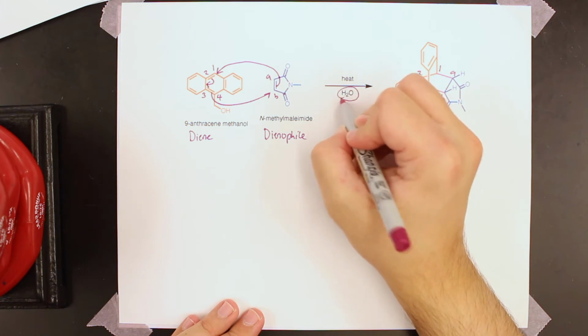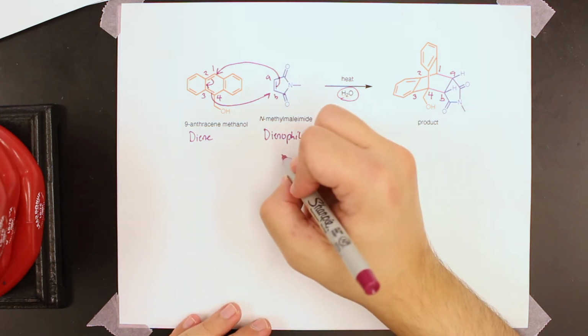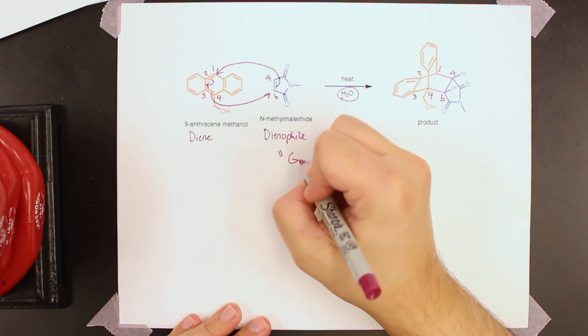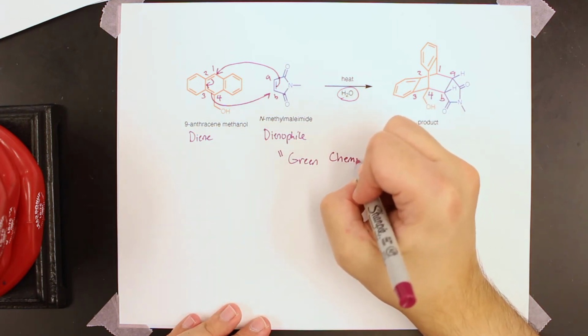What's special about this reaction is it's being performed in water, which is kind of unusual in organic chemistry because not a lot of organic compounds are soluble in water. And this reaction exploits, or fulfills rather, some principles of what we call green chemistry.